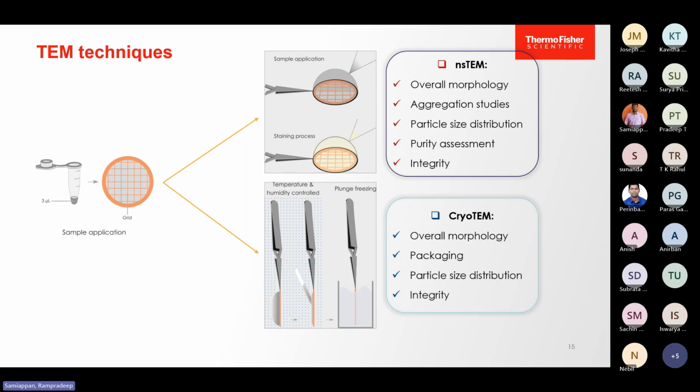For cryo-electron microscopy, the most important part, once the sample is ready, is the vitrification procedure. Your sample will be placed in a chamber, either a Vitrobot or a Leica equipment, in a temperature controlled chamber with humidity control. Normally, we can freeze at 4 degrees Celsius.